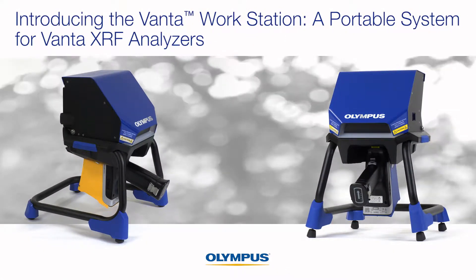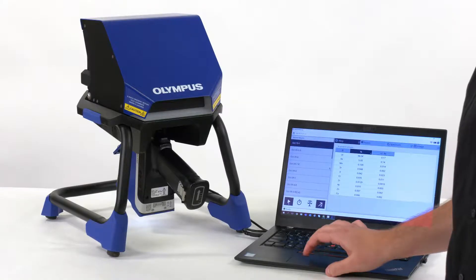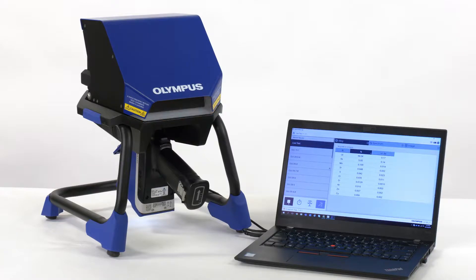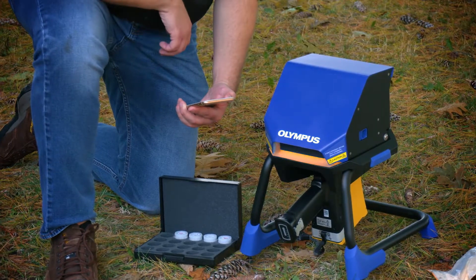Introducing the Vanta Workstation, a portable system for Vanta XRF analyzers. The workstation enables your Vanta handheld XRF analyzer to be used as a benchtop system or a rugged, portable platform in the field.